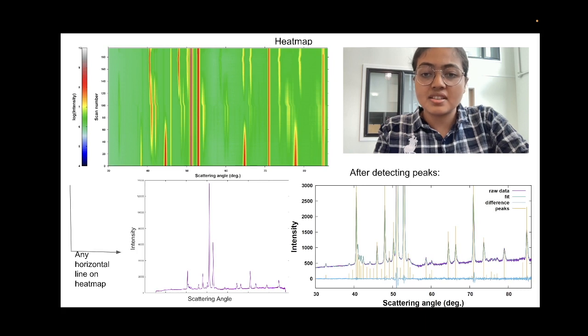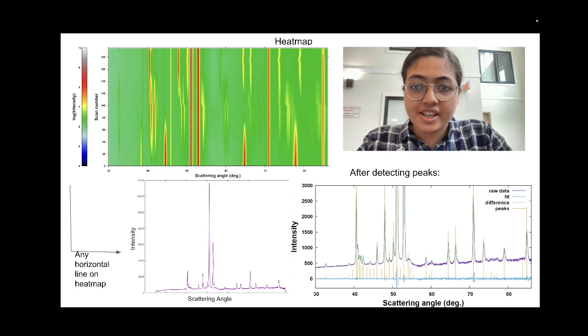Trim out the data that is useful across all scans and make a heat map for visualization. A unique algorithm to detect the peaks in order to feed input to the software, which here is Topaz. Iterating with Topaz to fit all the scans automatically by converting the output files to the next input file, and an algorithm to group relevant peaks together so that they can be studied to see how the electrochemical phases change over time.